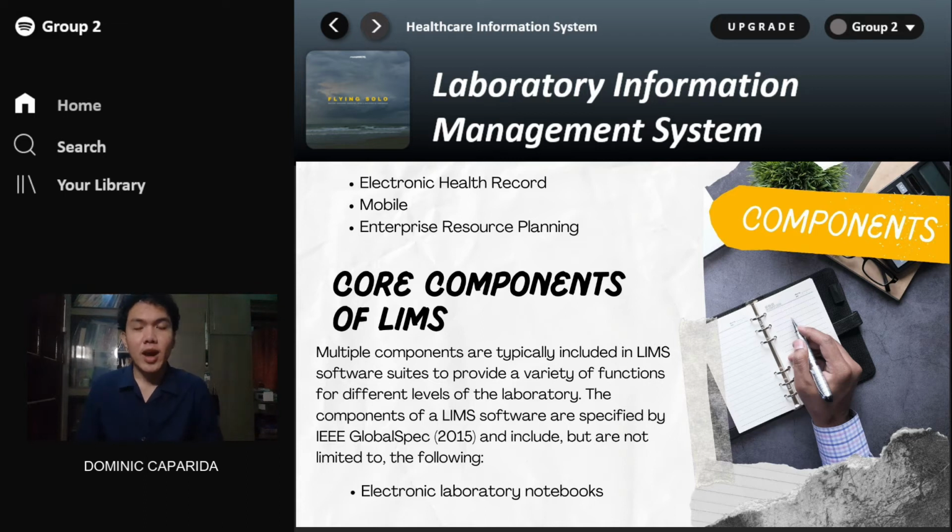According to IEEE Global Spec in 2015, they specified but not limiting to these components of LIMS softwares. So first is electronic laboratory notebooks, or ELN. These ELN are used in the laboratory where it is derived from the paper laboratory notebook.